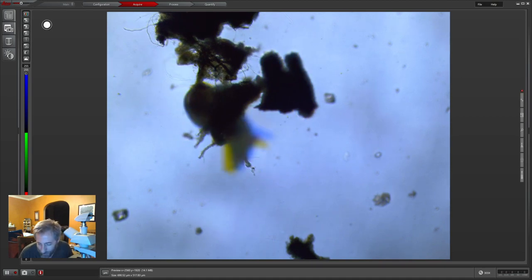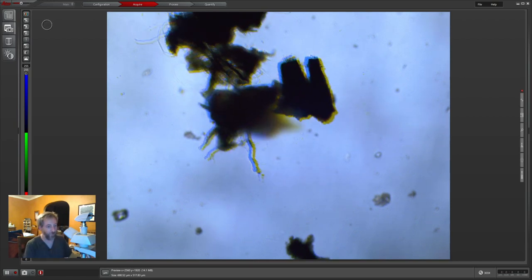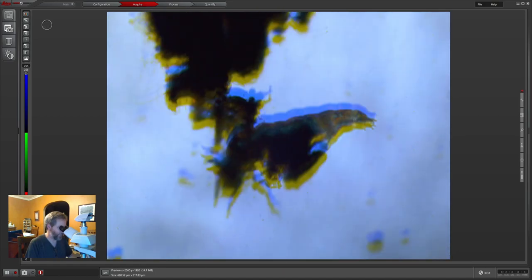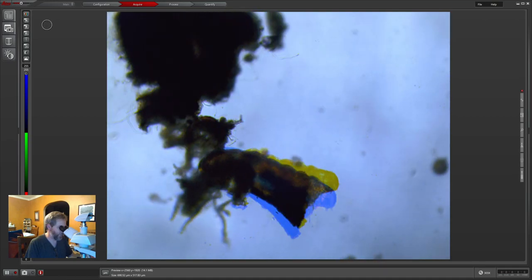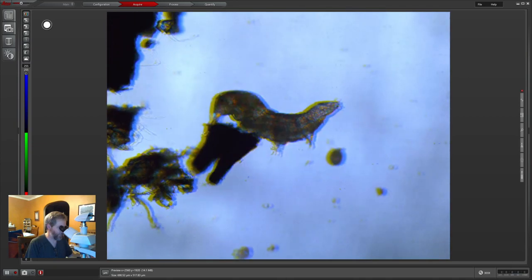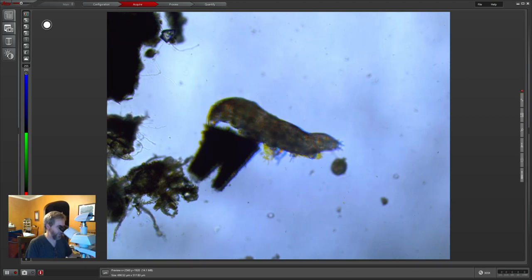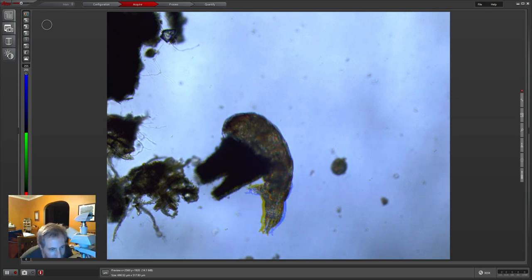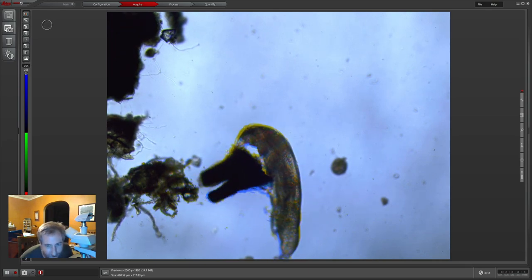I have one on a coverslip that we can put on the SEM — it's the same type. This slide I'll probably keep with the eggs on it. I don't want to lose the eggs. He's got disconnected from his little pile of junk he's been crawling around on. Yeah, that's a water bear.